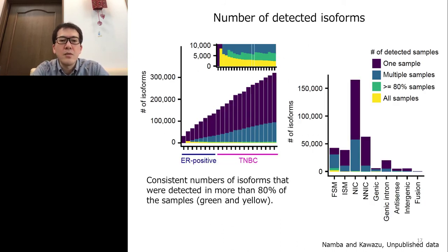To see if we used a sufficient number of samples, we incremented the number of samples to be analyzed one by one.